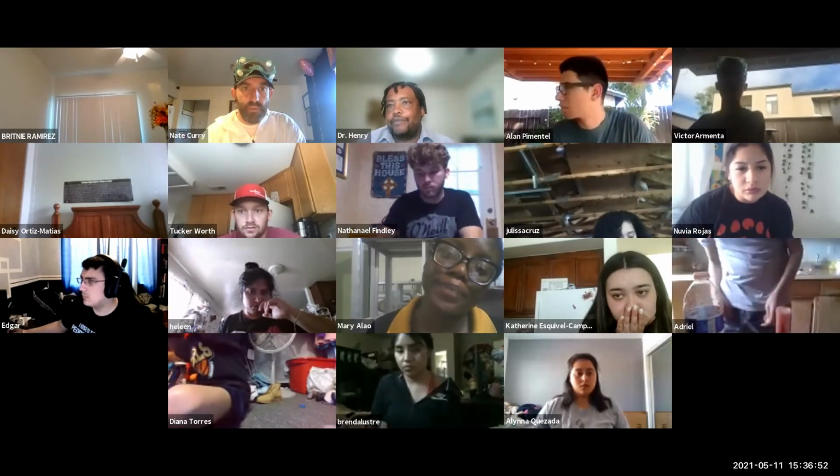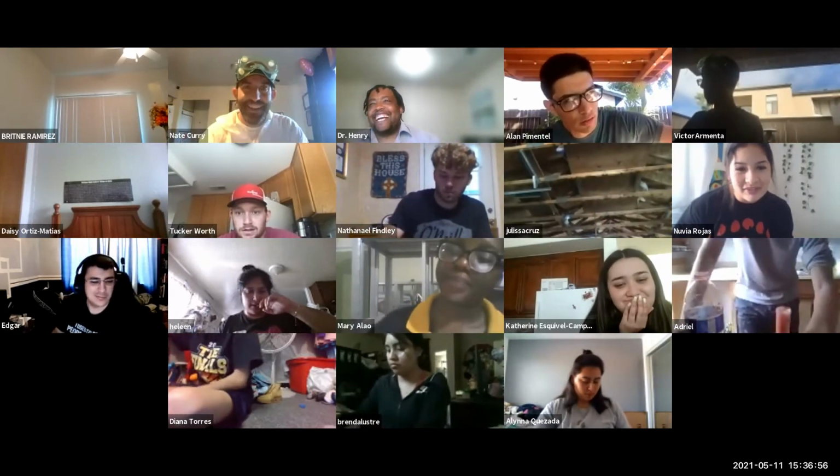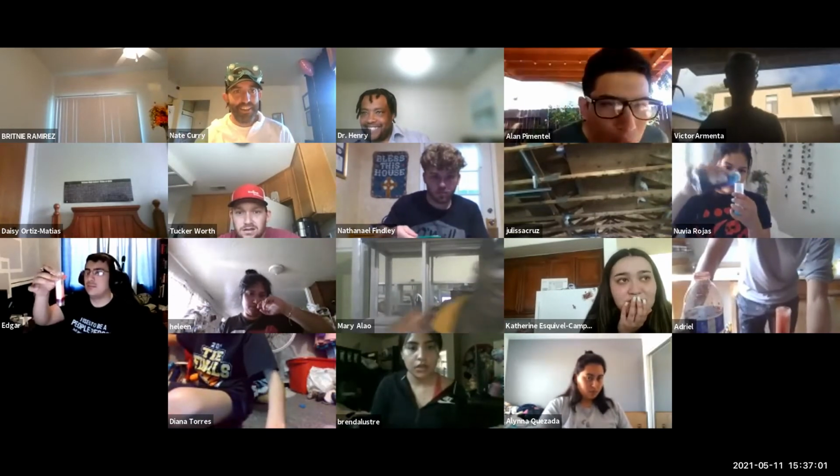There's more steps when I refresh it. Can I go back? No, that's exactly the point. There's supposed to be more steps. All right, now I got to make sure I did it right.